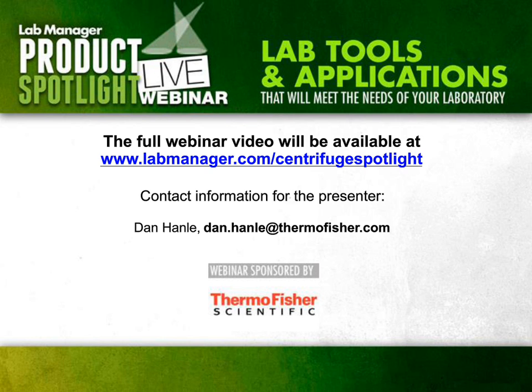Great, thank you. Are there any limitations in how fast you can spin the carbon fiber rotors? Well, I'm sure there is. We really haven't found it yet. Our limitation has been the centrifuges. The centrifuges were all designed back when metal was there, and what you see are the limitations of the metal centrifuges. Now, what happened was it's a catch-22. It's a feedback loop. The applications have stayed within what metal could do with the current motor technology of those days, motors and drive. So yeah, actually we can do more things with carbon fiber.